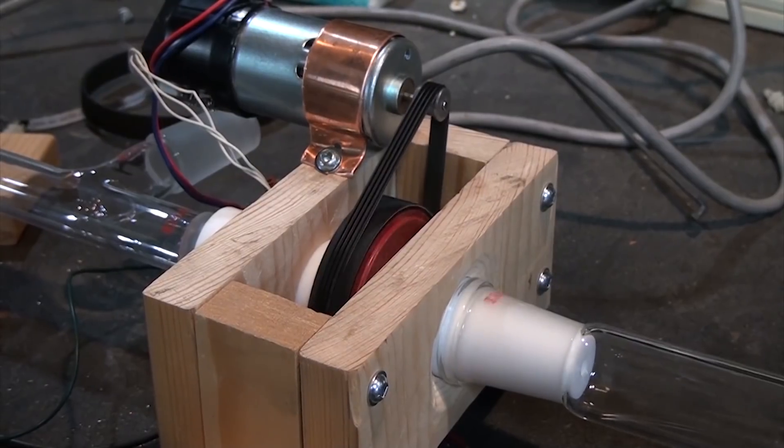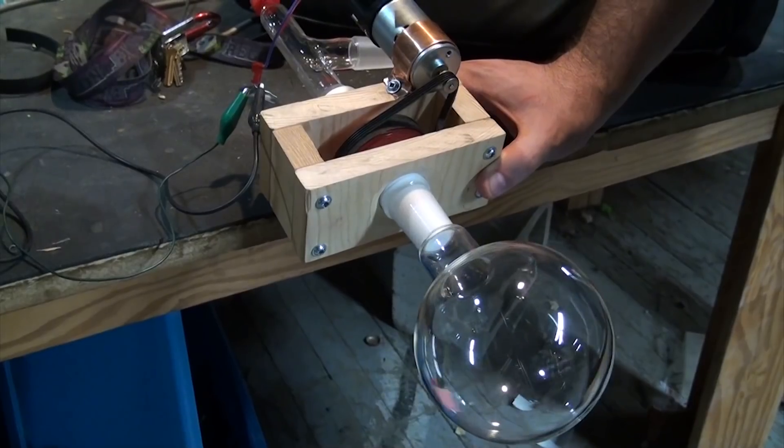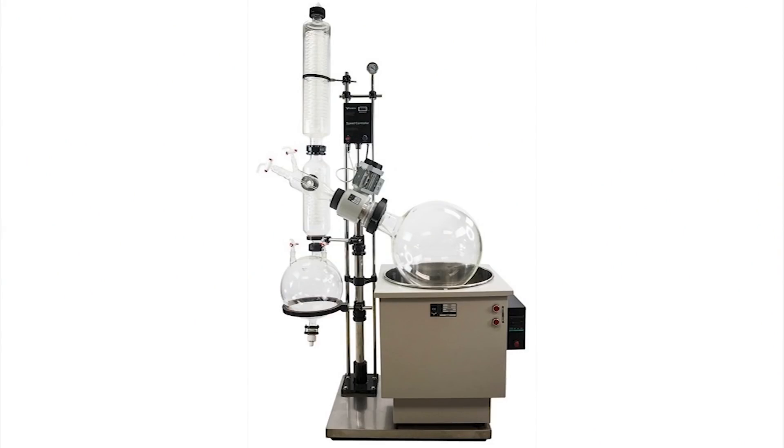Today I want to take you through my latest machining project and honestly I'm really proud of this one. Over the last few days I made this, which is a rotary vacuum coupling. Well, it's one of the main components of a device called a rotovap.